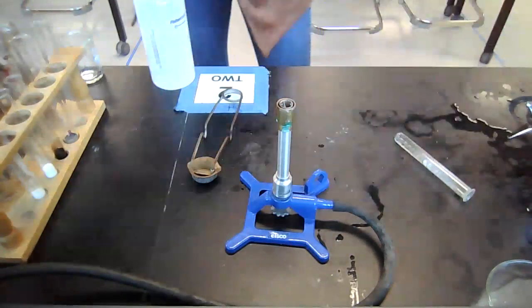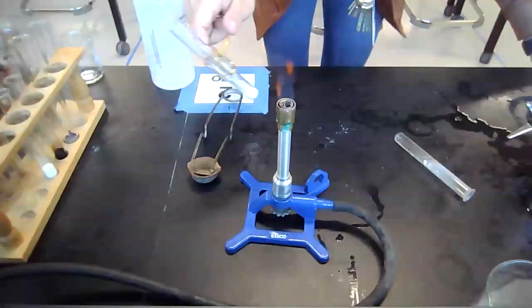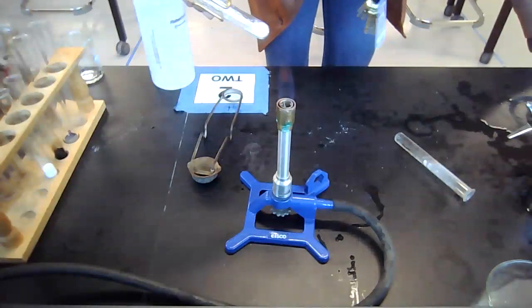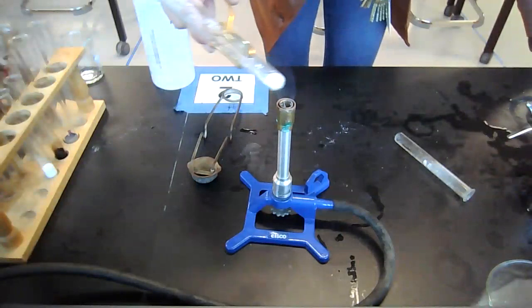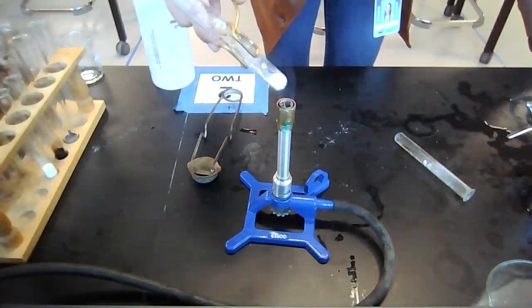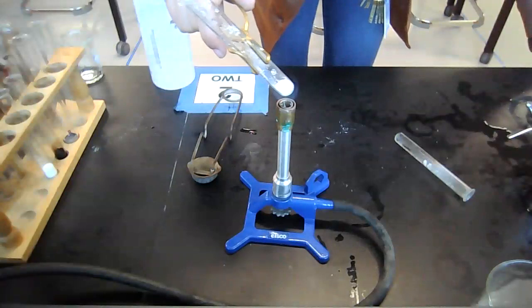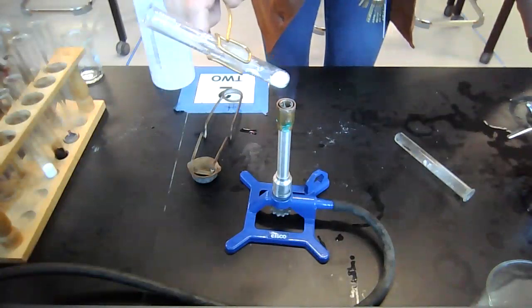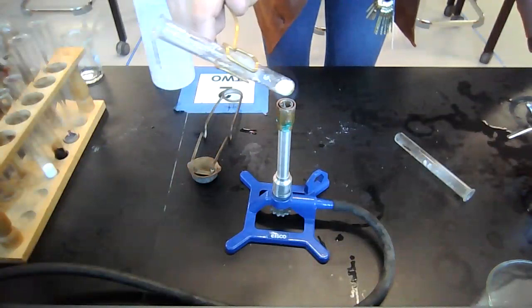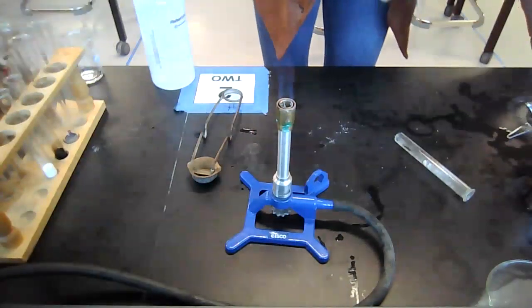And do our next one. So our next one is sugar. So this is going to be glucose. We're starting at 522. So obviously taking a little longer on this one, but it is starting to turn to a liquid now at 537. So you can see the bottom is starting to liquefy. So I'm going to stop it now.